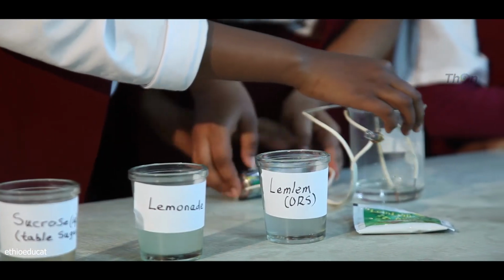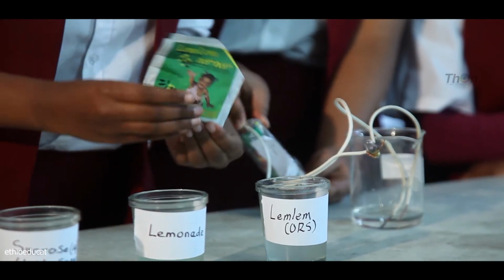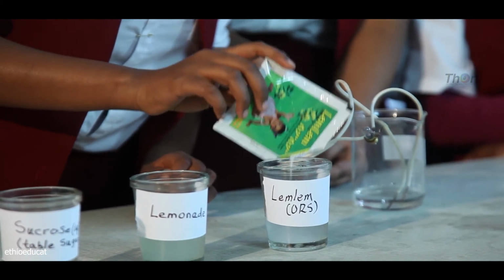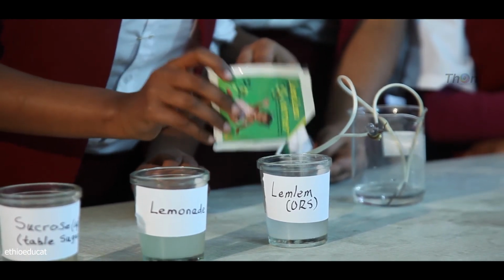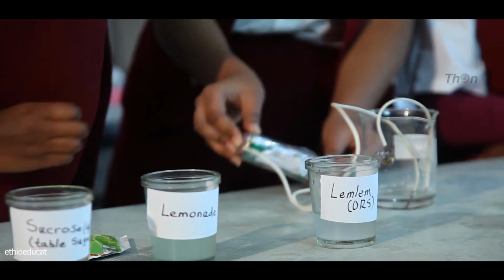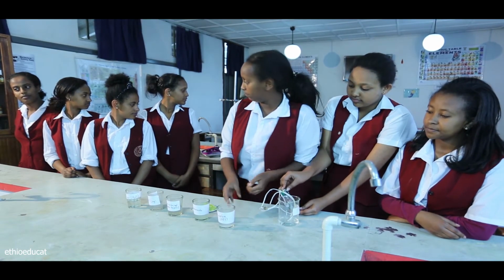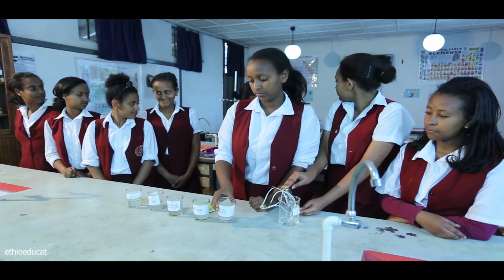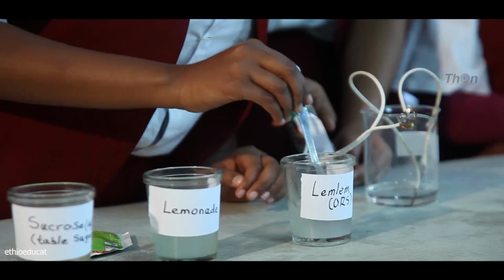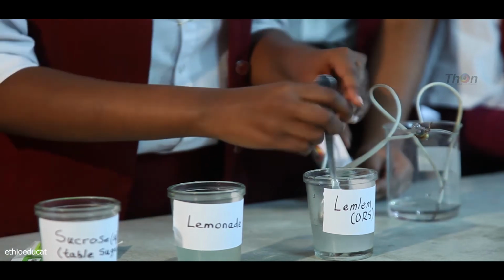Good job. Okay. They're touching each other. I will need a spoon to do this. Could you pass me a spoon, please? Thank you. Let's concentrate it a bit more so that you see the effects.